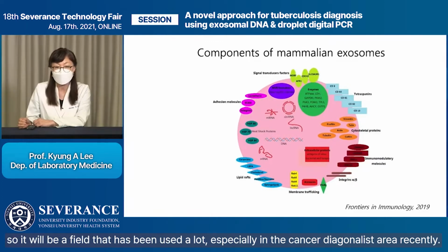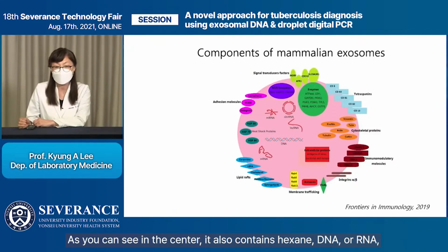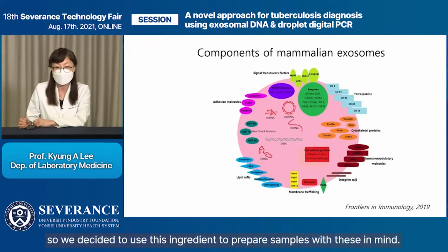So it has been a field used a lot recently, especially in the cancer diagnostic area. As you can see in the center, it also contains DNA or RNA, so we decided to use this ingredient to prepare samples with these in mind.